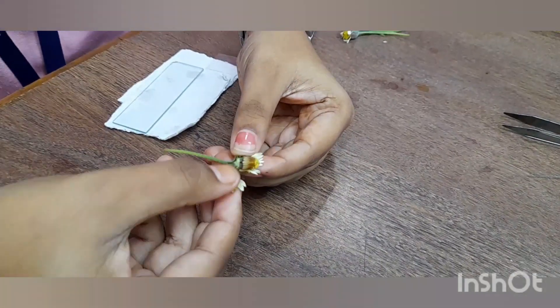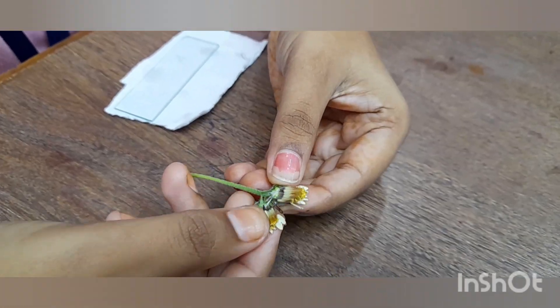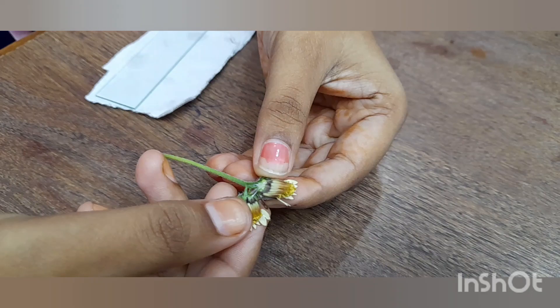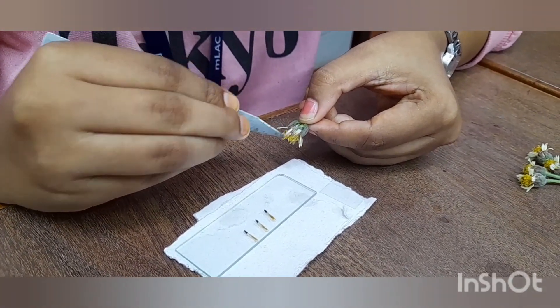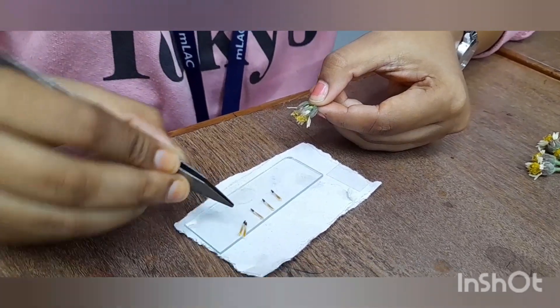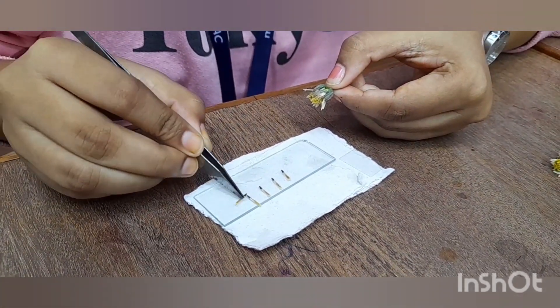The procedure is as follows: collect the Tridax flower and select a mature flower that has just started to wilt. Using forceps, remove the petals and sepals from the flower to expose the ovary. Using forceps and needles, carefully cut open the ovary and extract the embryo.